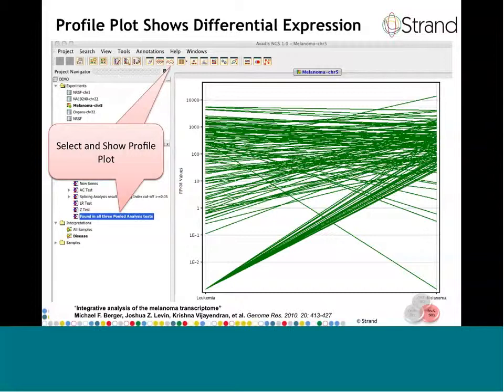And the reverse seems to be true for a single gene that is not expressed in melanoma but is expressed in leukemia. So we have the usual set of differential expression algorithms that have been made popular by the array-based expression analysis tools such as GeneSpring. But in addition, we have some algorithms that are optimized for RNA-Seq data as well.